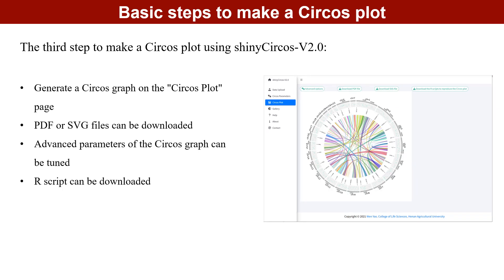The third step is to view the Circos plot on the Circos plot page, where you can see the plot created using the current dataset and plotting parameters. Users can download high-quality PDF and SVG files of the created Circos plot, and can adjust advanced parameters such as Circos legends, adding track indexes, and highlighting genomic regions. Users can also download the R code used to make the current Circos diagram to further enhance it.